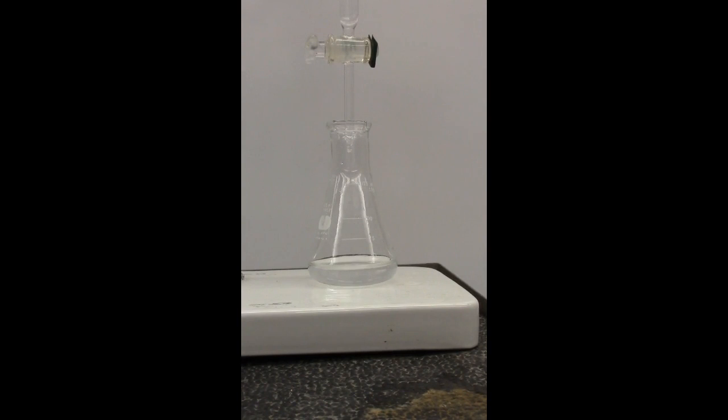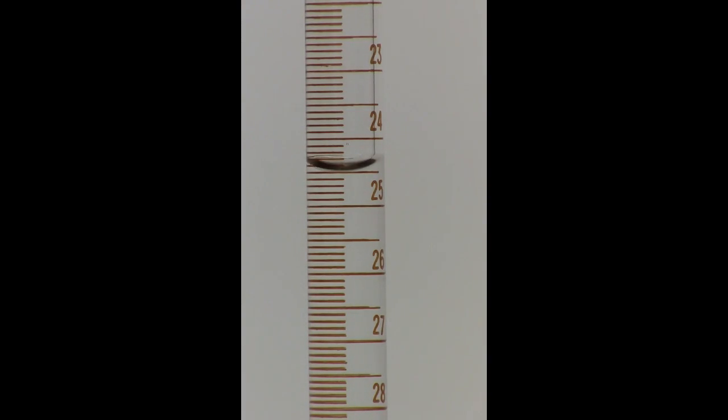Now let's say that the titration is finished. Now we want to know how much volume we dispensed. So let's go ahead and look at the final volume inside the burette. The final volume of the burette looks to be around 24.49. Remember to look at eye level at the burette and look at the meniscus when you're measuring the final volume. And also remember that it's measured 0 at the top, 50 at the bottom. So you're going to measure it looking this way. So 24 and then some, instead of 25 and then some.